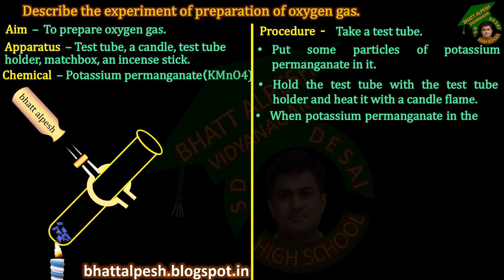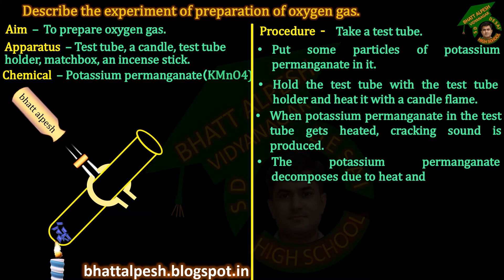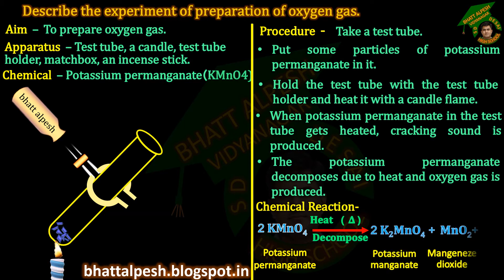When potassium permanganate in the test tube gets heated, a cracking sound is produced. The potassium permanganate decomposes due to heat and oxygen gas is produced. Chemical reaction: Potassium permanganate gives potassium manganate plus manganese dioxide plus oxygen gas.